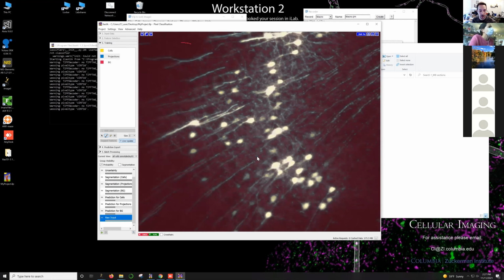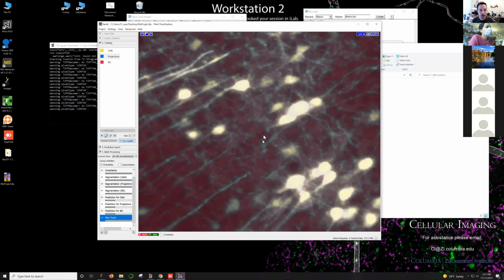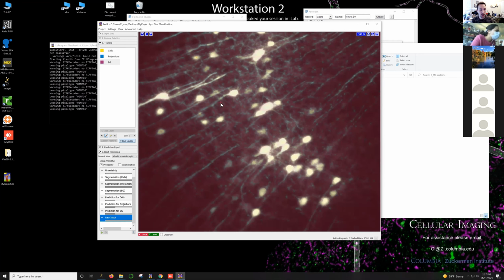Maybe I want to get a little bit more. I mean, projections are looking pretty good. It's already looking pretty good compared to what we'd be able to do with any other kind of segmentation. So we can refine this a little bit more, but you can sort of get the idea now.